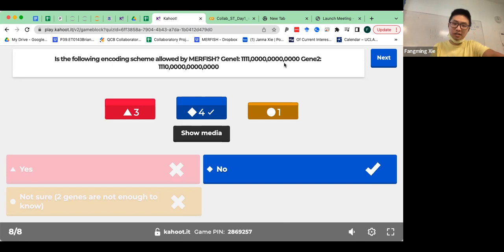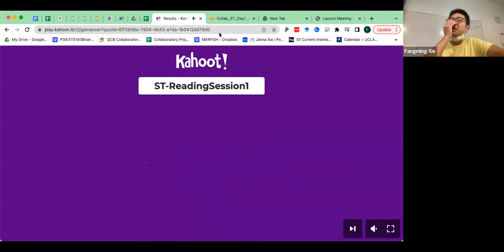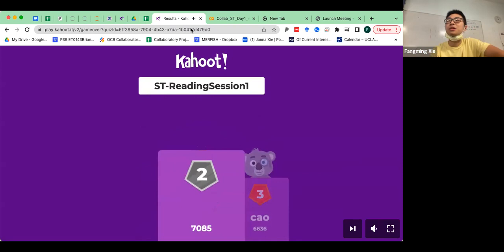So no. Okay, so that's all about Merfish. Merfish is one big branch and one leading technology of spatial transcriptomics. So yeah, any question? Do we need to take a pause here?